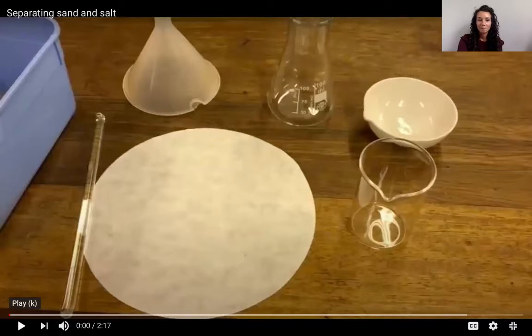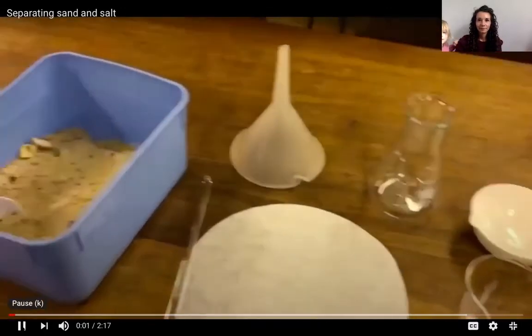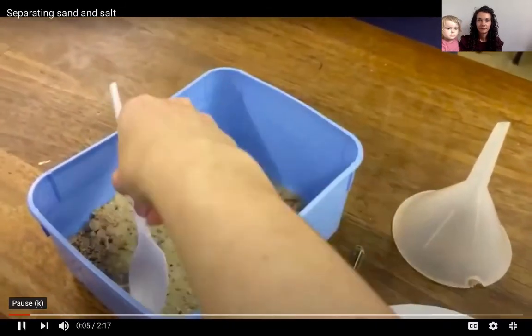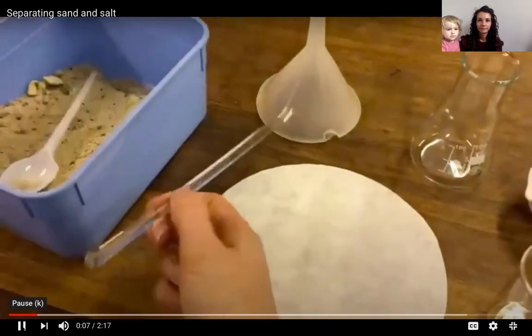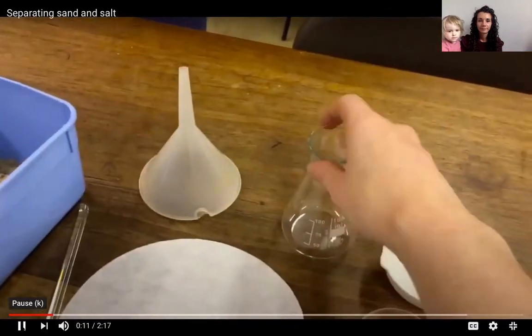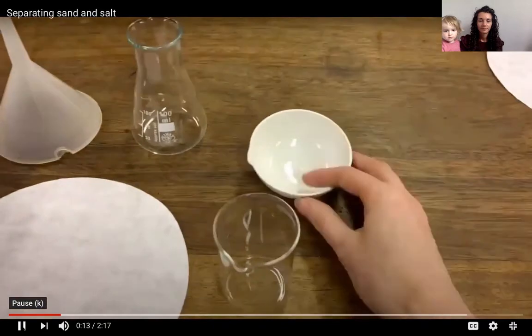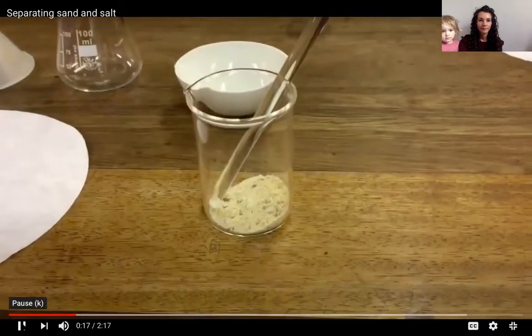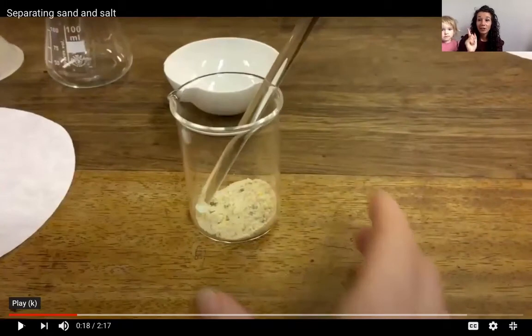Here we go. For this experiment, you'll need a sample of salt mixed with sand, a stirring rod, some filter paper, a filter funnel, a conical flask, an evaporating dish, and a beaker. Okay, now you're going to need to remember those pieces of equipment because I'm going to ask you to draw them out and label them a little bit later.